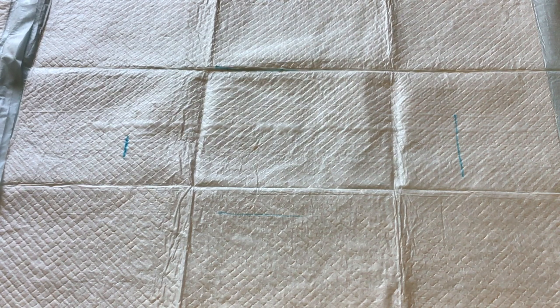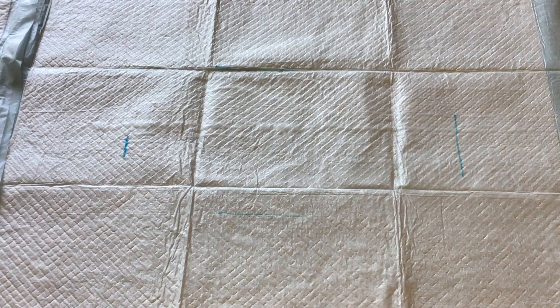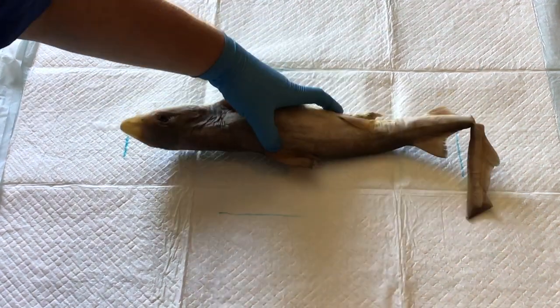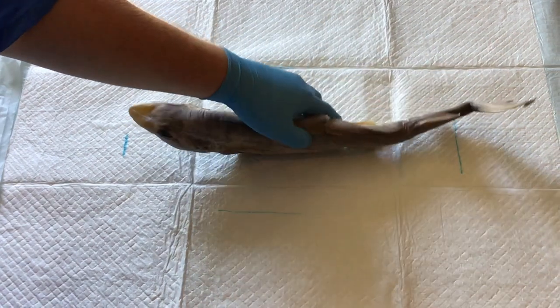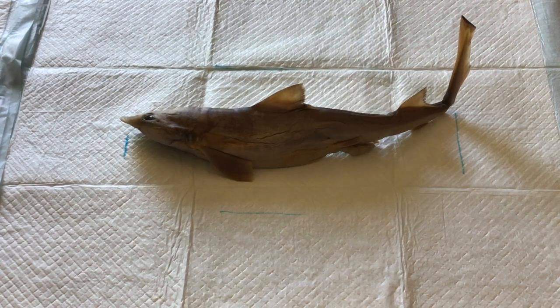I'm going to do the best I can to video this. Hopefully it turns out well. Even if it doesn't turn out the greatest, I might still release this video. But what we're going to be looking at is we're going to be dissecting a shark, okay? Now, I'm not going to be going super in-depth, and it's not going to be as entertaining as it would be in the classroom. But we're going to place the shark right here on the table, okay? Now, I'm probably going to need to adjust my camera a few times so you guys can see some things.